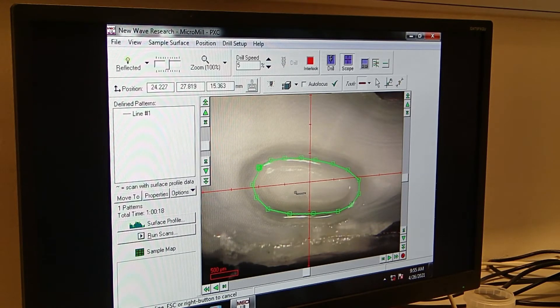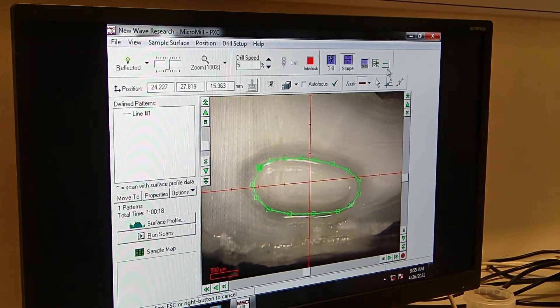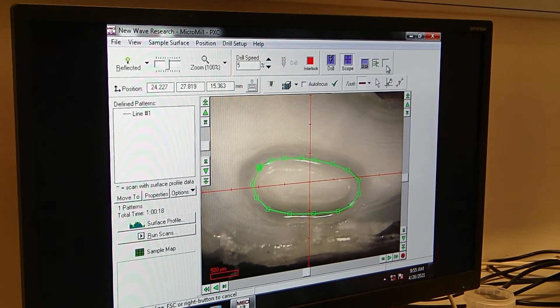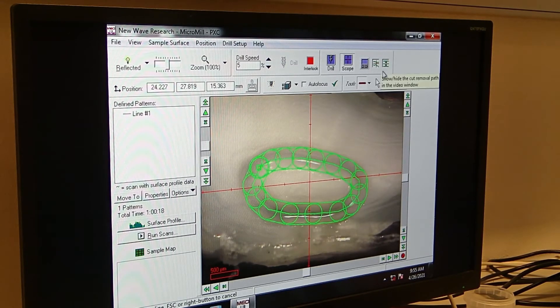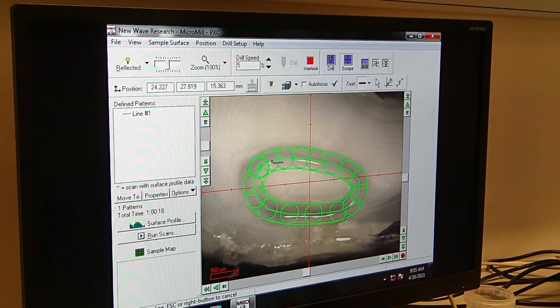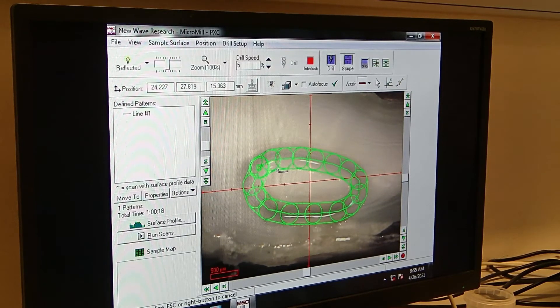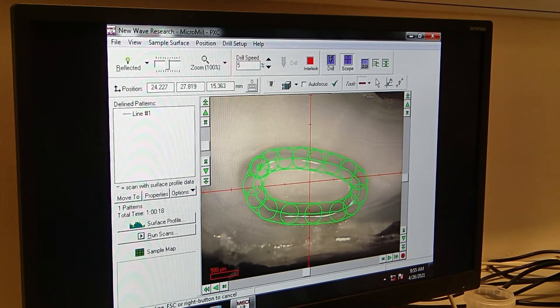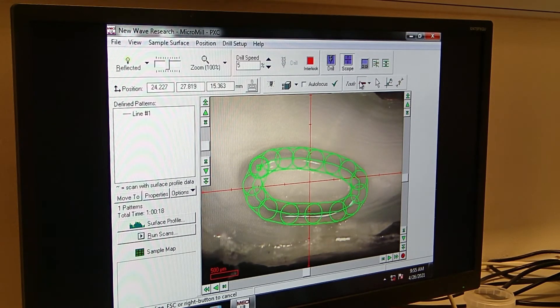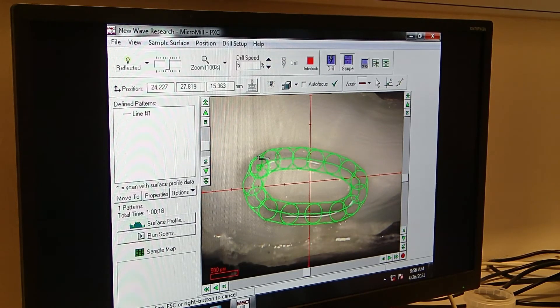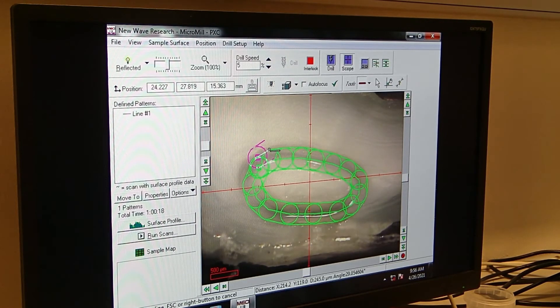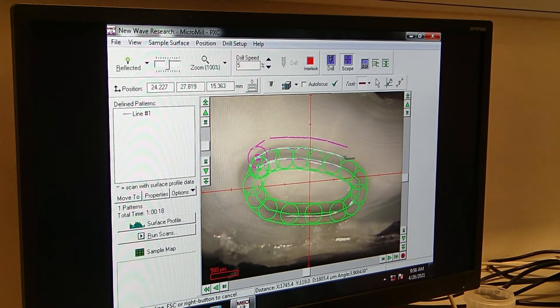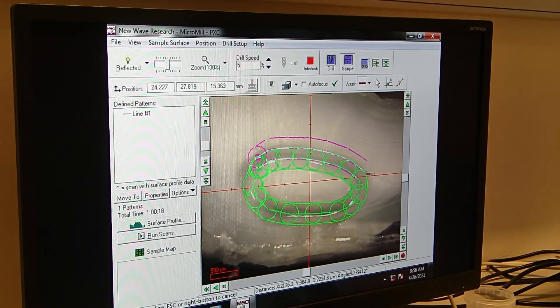Therefore, we do click on this green line above here, which says show/hide the cut removal path in the video window. So it adds 180 micrometer to both sides of the line. So now we're still in the line tool, and we just follow this outer line again by clicking on the left.